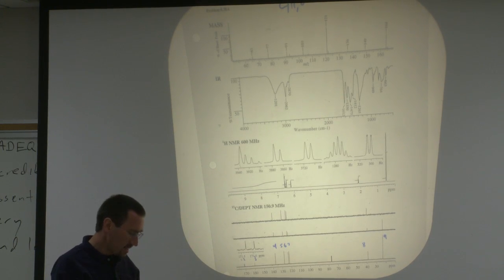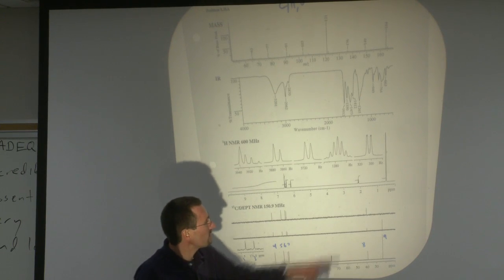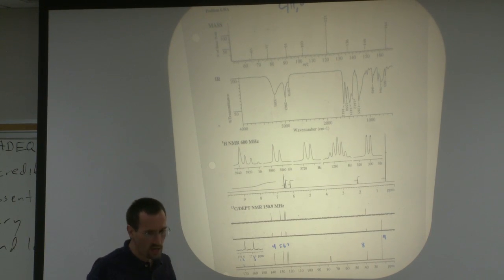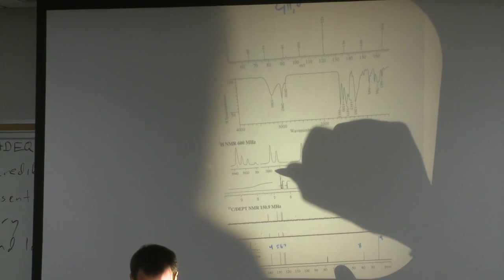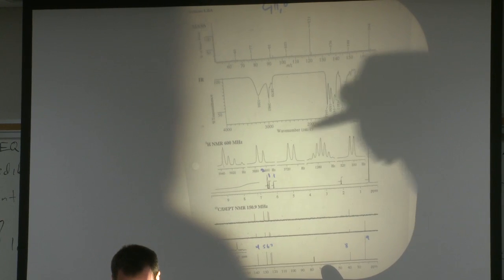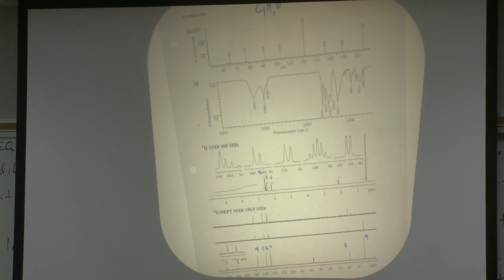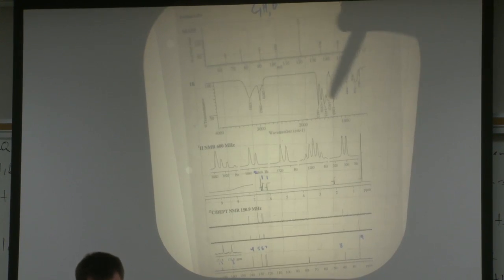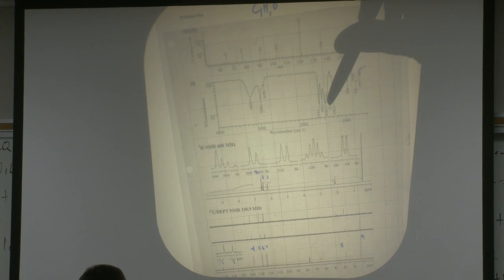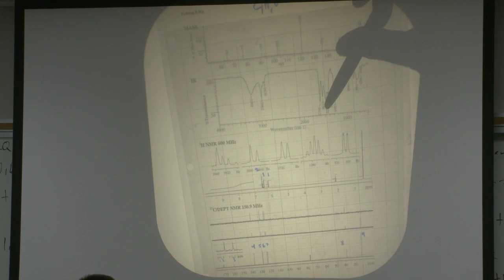and yet if you look at it, you'll see something interesting about the proton NMR. If you just work your integrals, you'll see 2, 1, 1. What do you do? You usually measure with a ruler, or you can slap a grid on it if you're feeling lazy and you don't want to be bothered drawing lines with a ruler.